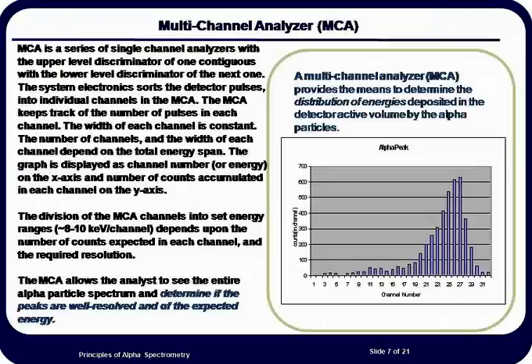The multi-channel analyzer also has a visual display so that the analyst can observe the actual energy spectrum. Some of the responsibilities of the analyst are to assess the shape, energy correctness, and resolution of all alpha peaks in the spectrum.